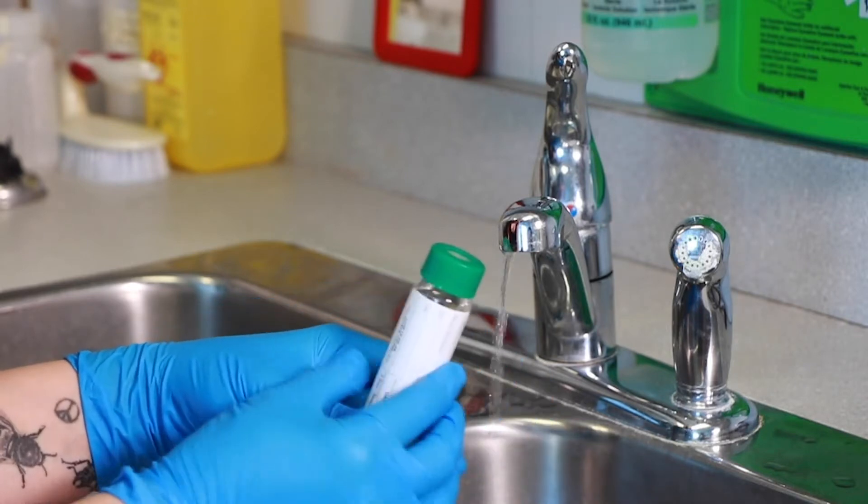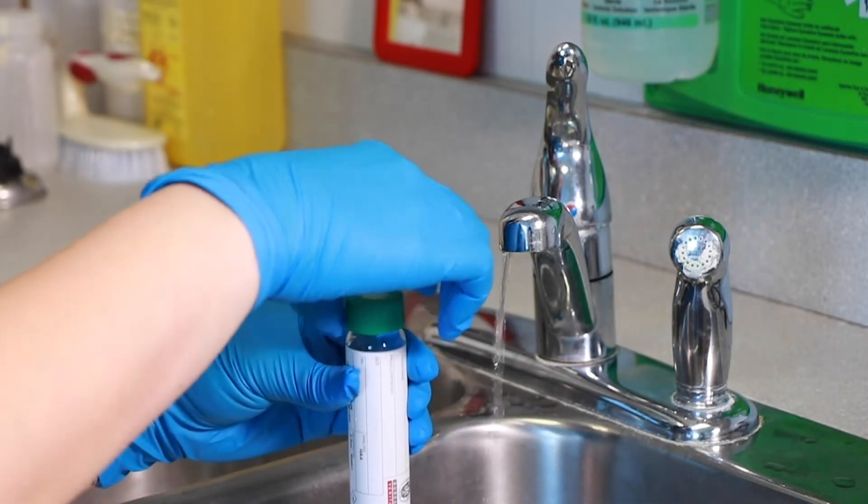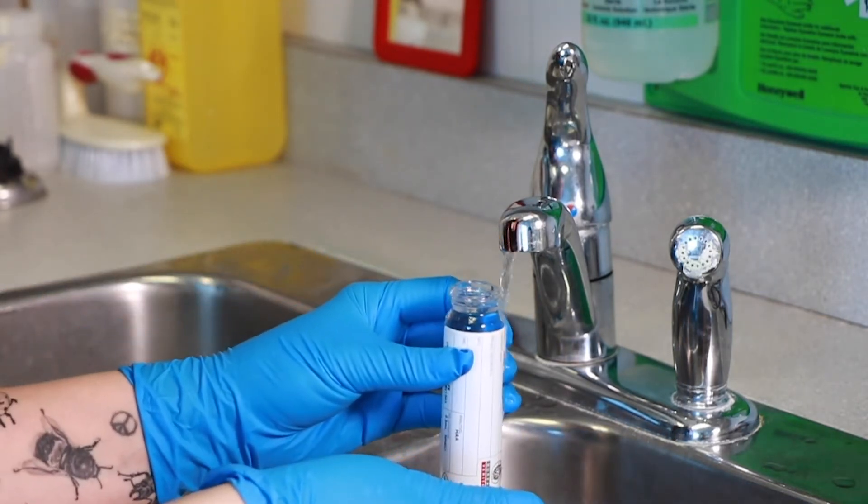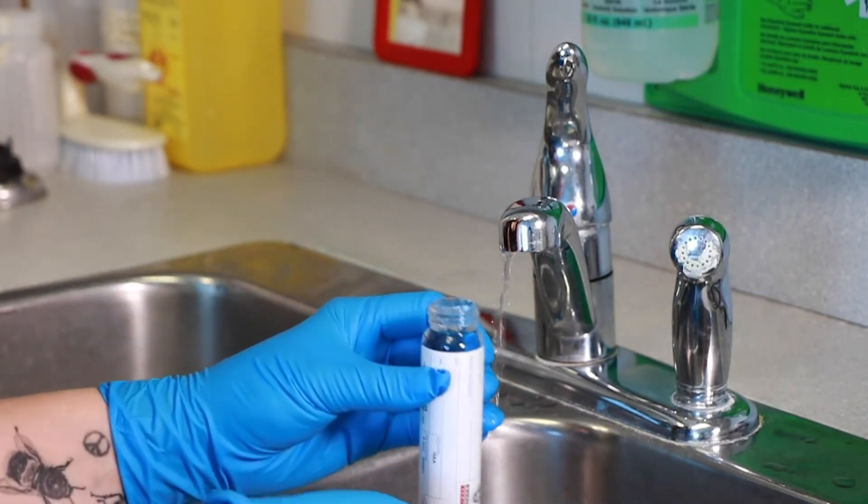This is how you re-sample if you've ended up with a bubble in your vial. Don't pour out the old sample, just top it up. Create a dome shape, wet the lid and reseal. Be careful not to spill.